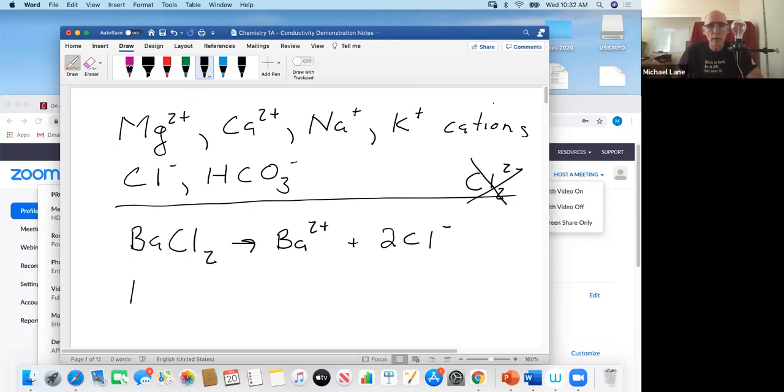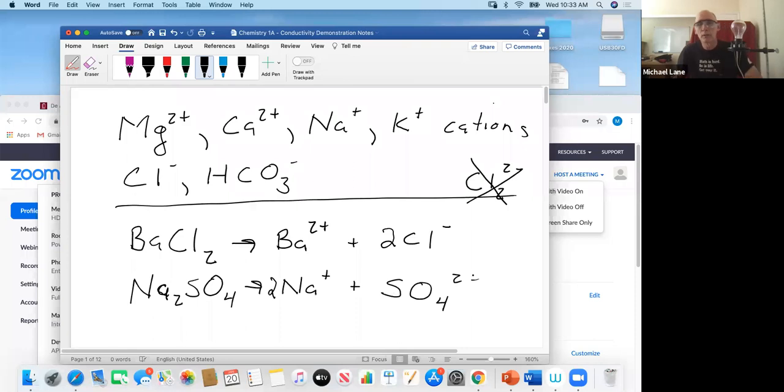The second one that I showed you was a solution of sodium sulfate. Now, if I had the solid material, it would have also been a white solid. And white solids typically provide solutions that are clear and colorless. So those are the two compounds that we used.